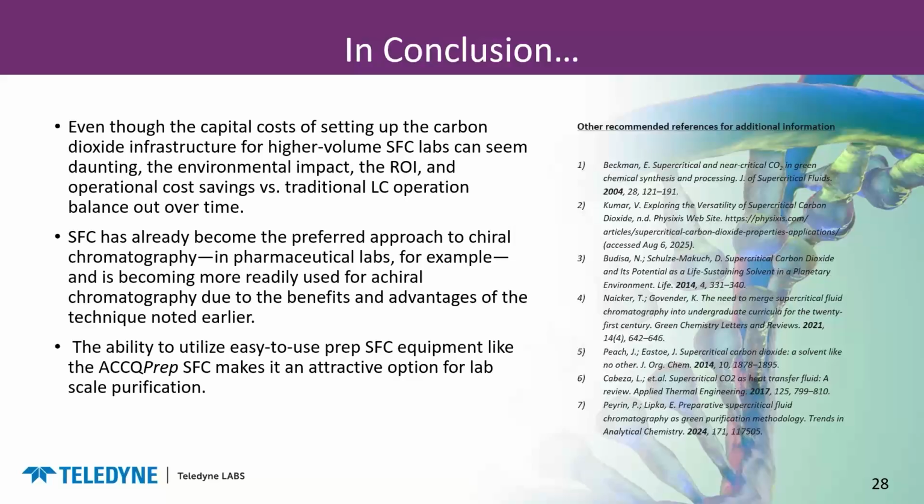So in conclusion, even though the capital costs of setting up CO2 for higher volume systems can be daunting, can be as high or higher than the cost of the instrument initially, those will be offset by the environmental impact, return on investment, and your operational cost savings over time compared to the typical LC operation in this day and age. SFC has already become the preferred approach for chiral chromatography, especially in the pharmaceutical labs like I worked in previously before joining Teledyne. We were using it for 95% of our chiral chromatography in recent years.